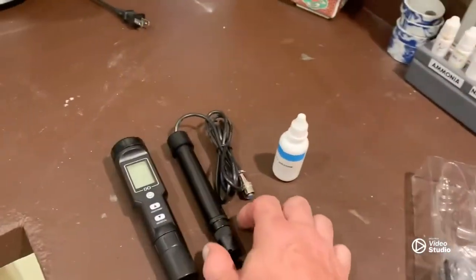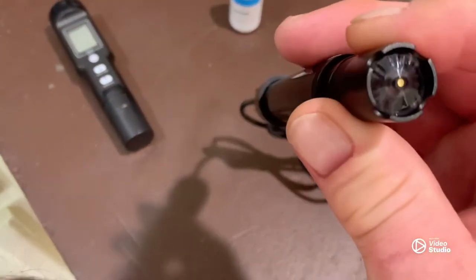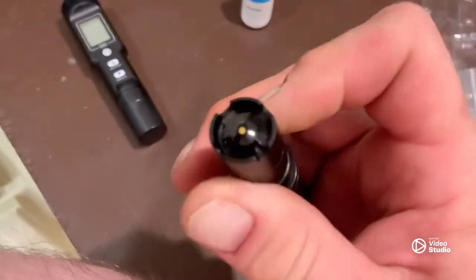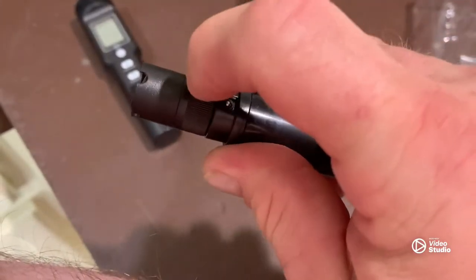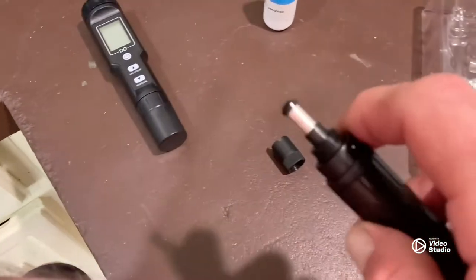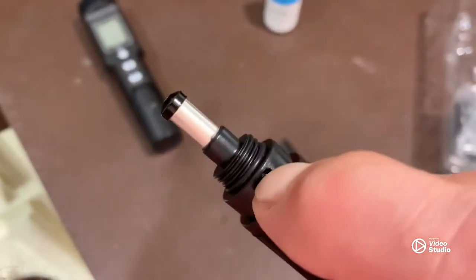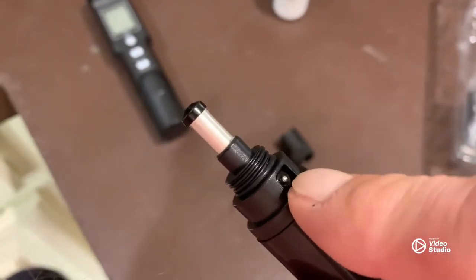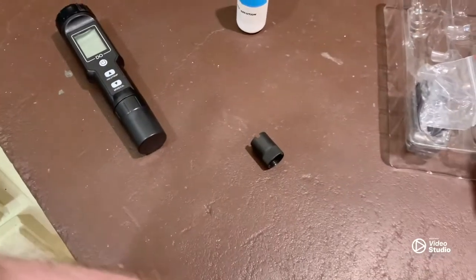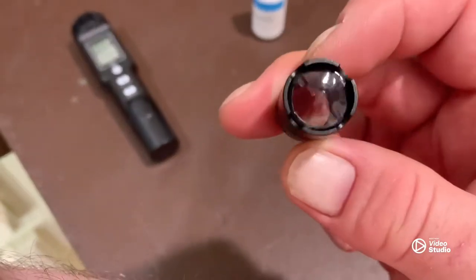The first thing you have to do is make sure that the membrane on the cap is not damaged. There's a little knurled part right here and you're going to open it up just like that. That's the actual oxygen electrode. This little silver part right here is the temperature sensor, so you want to be very careful with that part.